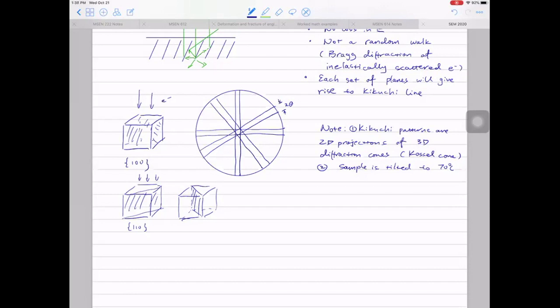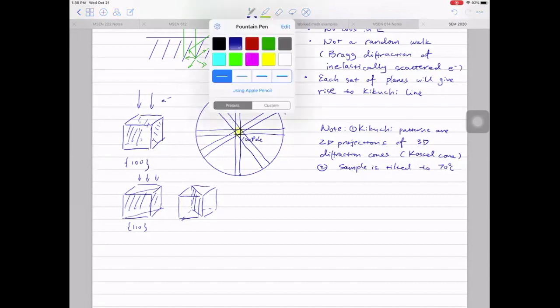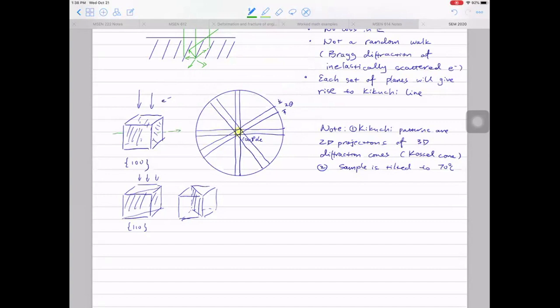Continuing from last week, we have this Kikuchi band pattern showing the symmetry. At the very center we call it a pole — specifically this is a [0,0,1] pole. Then what happens if we rotate the crystal in real space? What's going to happen to the Kikuchi bands? Assume we rotate the crystal like this.